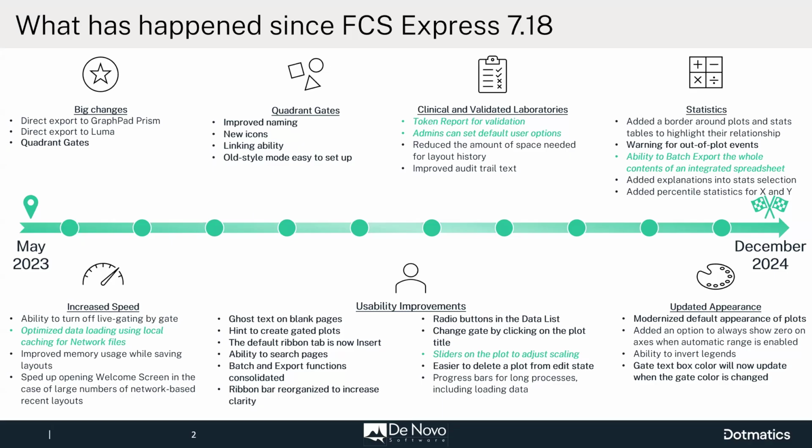So now we're going to cache those on the local computer where you're working. Because of that, we won't have to go back and forth to the network as often to pull those data files. So you should be able to see that things are much faster, and it should be a visible improvement from where you were before. This is actually really cool and has been a long time coming.